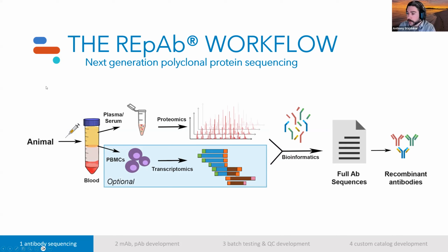We have the luxury of working with many different animals, as I'll show you in the next slide. But typically what we end up doing is we take the serum from the animal of interest and we purify it against, firstly, we usually run a protein A or G purification to reduce the polyclonal antibody population to just IgGs. And then we antigen affinity purify against your target of interest.